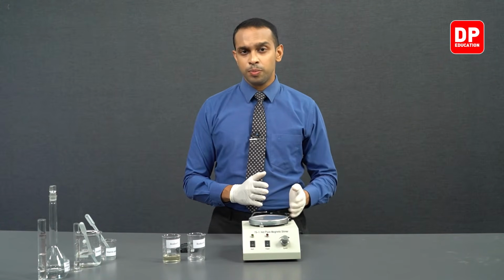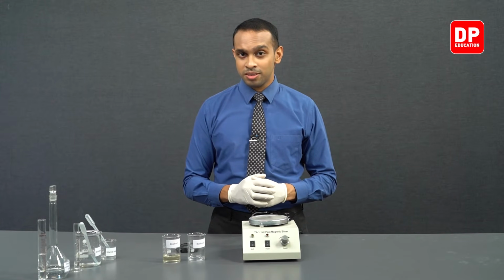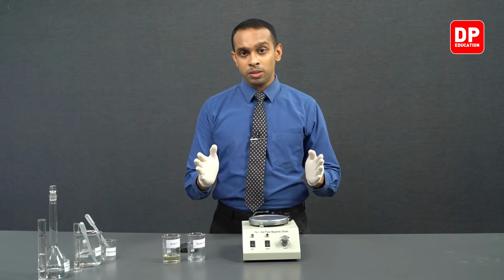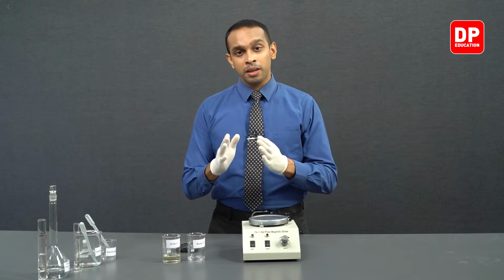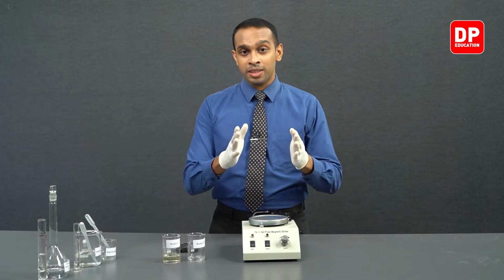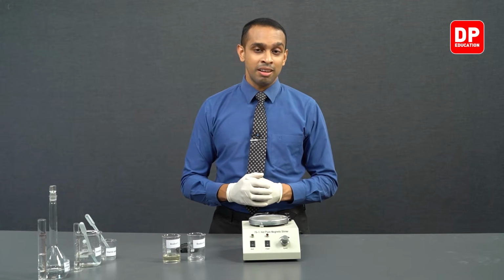In the first part of our experiment, we saw how the change in the concentration of Fe3 plus ions in the medium affected the rate of the reaction. The rate of the reaction was measured by how long it took for an equal amount of iodine to be produced when we changed the concentration of Fe3 plus ions. So we kept changing the concentration of Fe3 plus ions in 5 different solutions, and we saw how the time taken for the same amount of iodine to be produced increased as we decreased the Fe3 plus ion solution concentration.